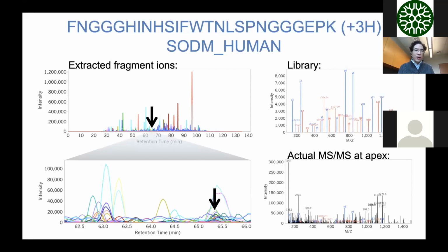And the only way that I can know that is I can use fragment ion intensities that I've already measured of this particular peptide that I've seen in a DDA experiment in this particular case. So if I've seen this peptide in a DDA experiment, I can say, well, this peptide specifically should have a nice Y8 and a Y9 signal, pretty good Y10, Y11, Y12, and I can pick those Y8 and Y9 signals as being high and the Y10, 11, 12 as being present in the background, despite the fact that there might be 20 or 100 different peptides eluting in this precursor mass range around this peptide at the same time. Obviously, this is an extremely complicated spectrum at the apex of the fragment ion space. Okay, and so by using the commonality of those ions, we can make a call as to whether the peptide is present or not.